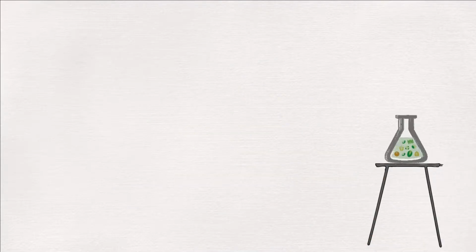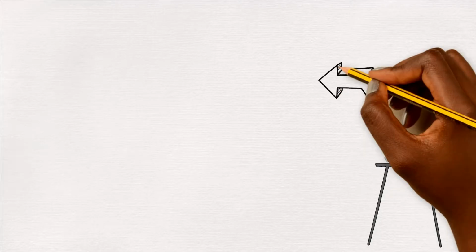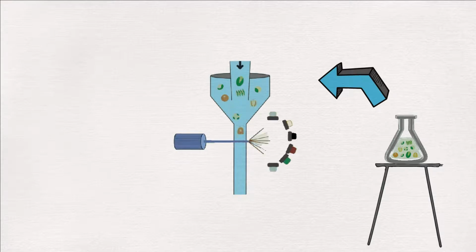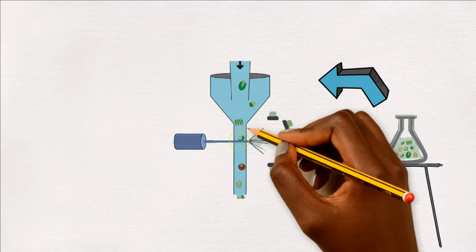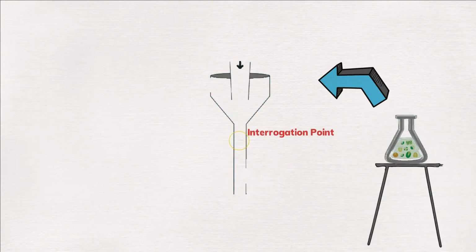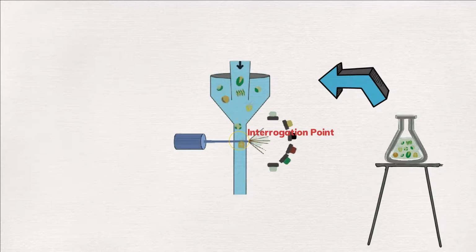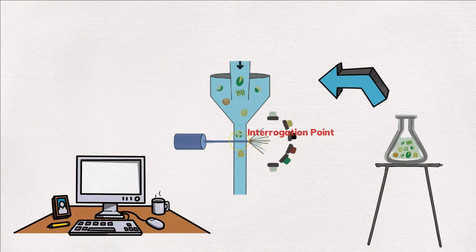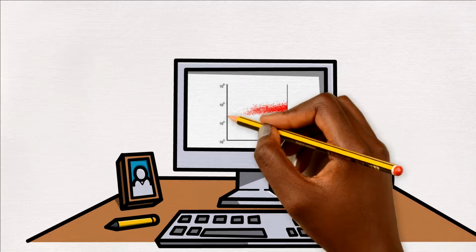In a flow cytometer, a sample containing cells enters the equipment and is mixed with a saline solution. Cells then move to a narrow channel and are disposed in a fine line, right before entering the interrogation point. At this site, each cell absorbs the light of the laser and the scattered fluorescence is captured by the detectors. The signal is then processed with the computer and displayed in beautiful plots.